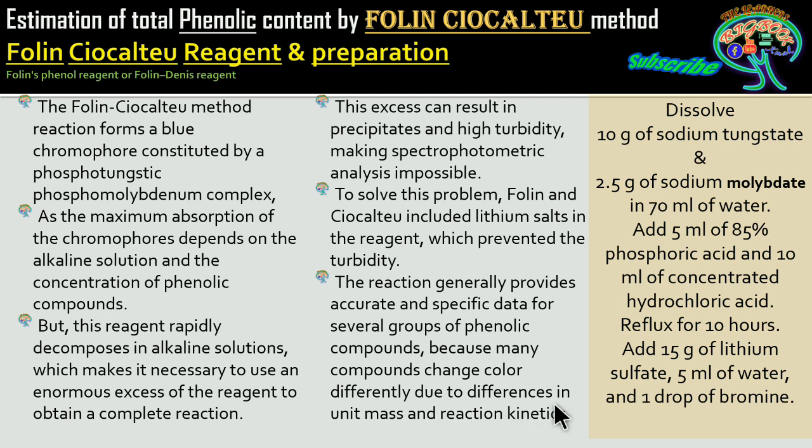Here, it is not going to give an entirely different color; it is nearly this particular bluish color itself. Somewhere there will be a highly intensified blue, somewhere a light blue, somewhere a bluish green. In the same manner it is going to give the colors. To some products it may change to another color, but with most phenols or polyphenols, it is going to give the blue color itself, differing in its intensity or with a slight change in its bluish color.